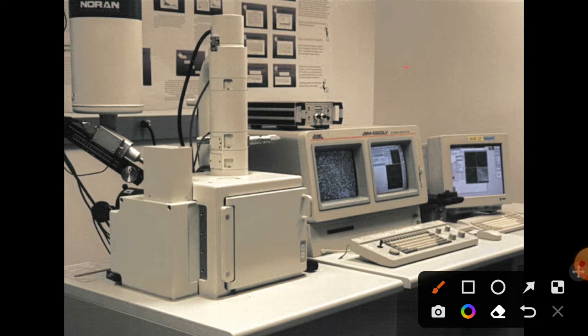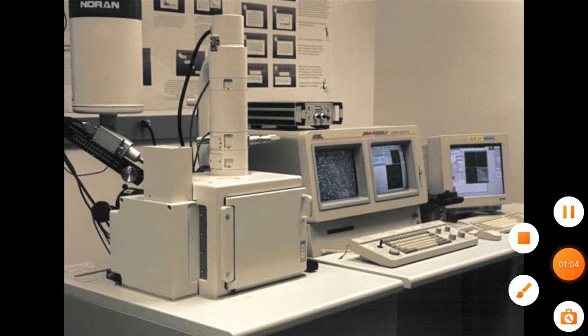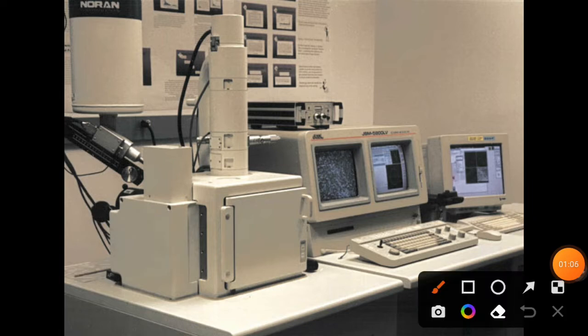In our previous video we discussed transmission electron microscopy, but there was a problem that I told you about: we spend crores of money on transmission electron microscopy, but still we are getting what? Still we are getting a 2D image. That is the need why scanning electron microscopy, or SEM, which is today's topic of discussion, was developed.